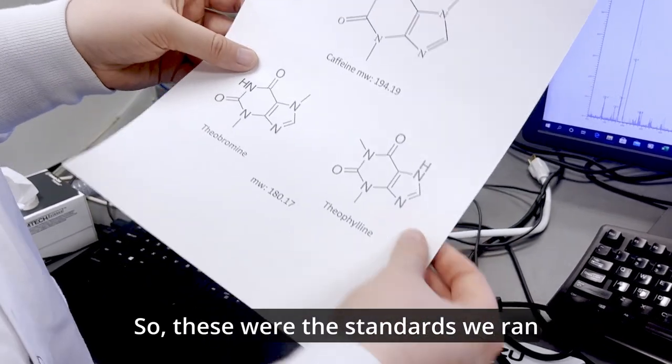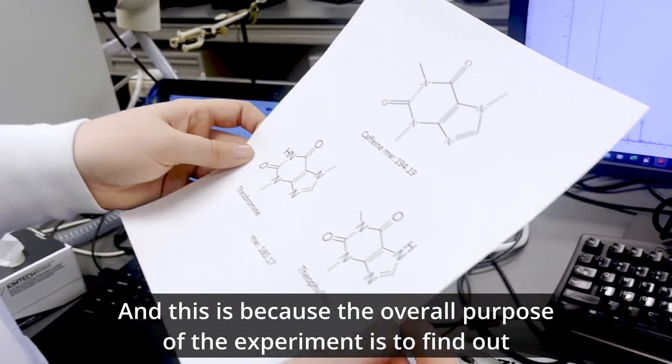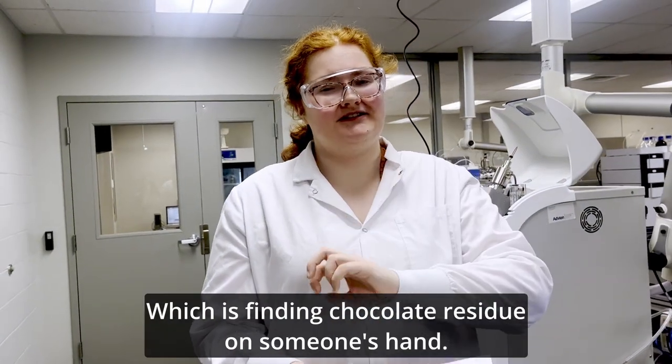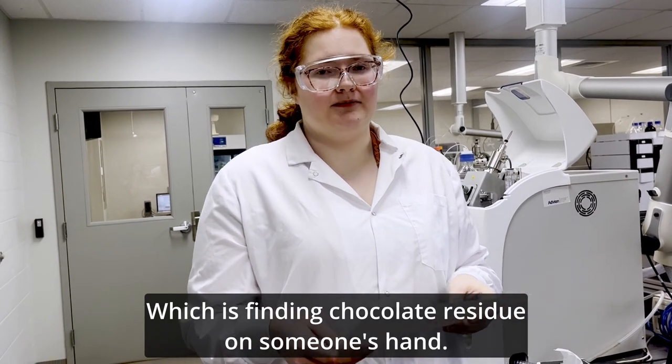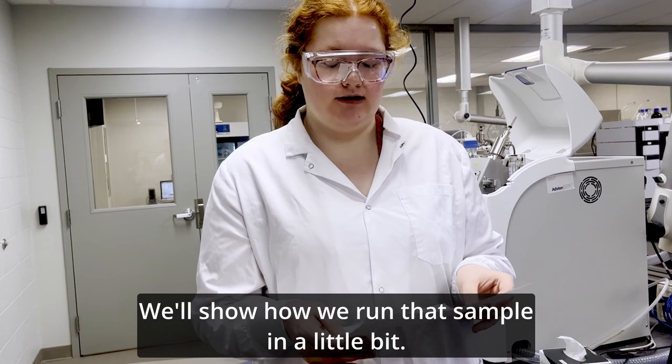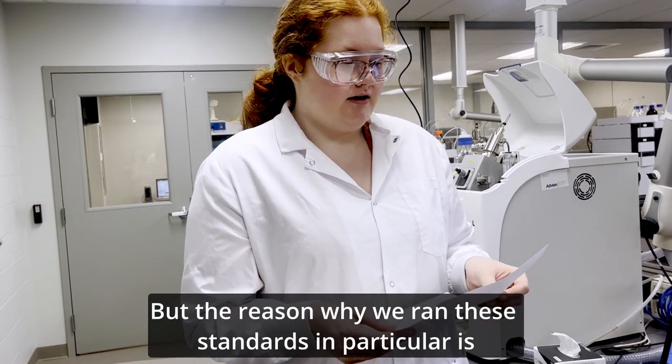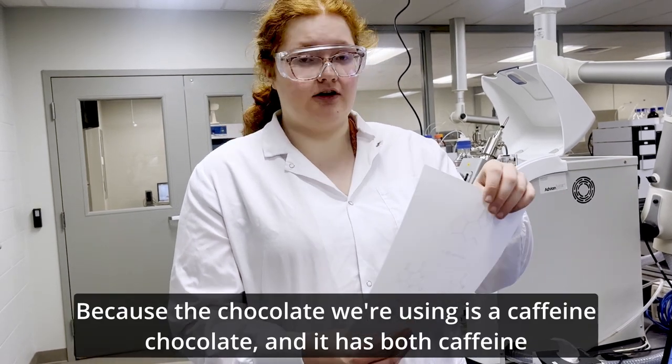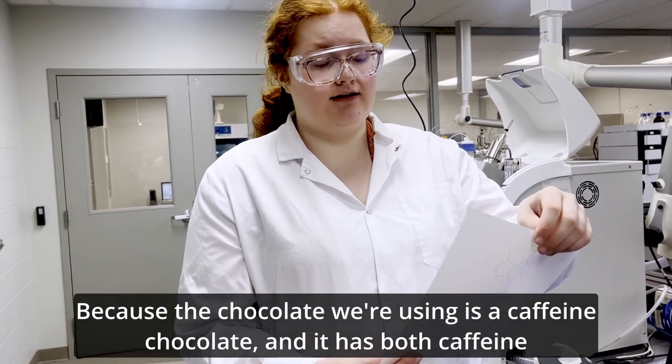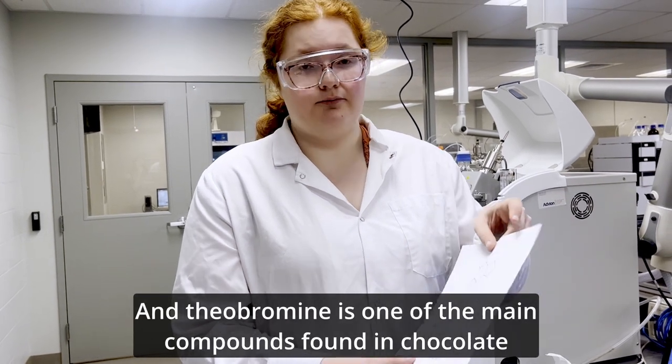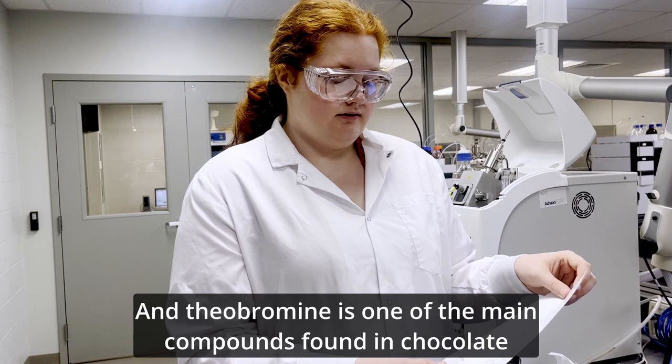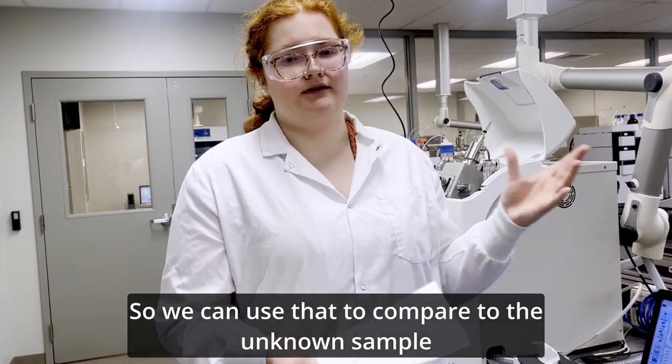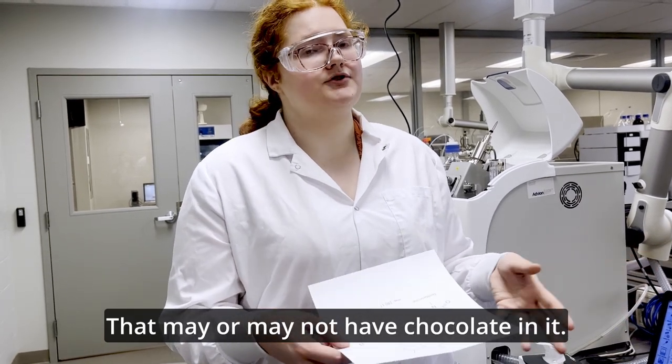So these were the standards we ran, and this is because the overall purpose of the experiment is to find out who ate the chocolate, which is finding chocolate residue on someone's hand. We'll show how we run that sample in a little bit. But the reason why we ran these standards in particular is because the chocolate we're using is a caffeine chocolate and it has both caffeine and theobromine, one of the main compounds found in chocolate. So we can use that to compare to the unknown sample that may or may not have chocolate in it.